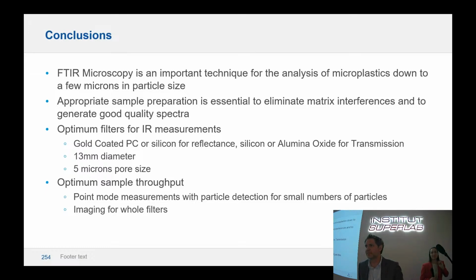Thank you for a nice presentation. I have one question regarding the reflectance mode. Is it really useful when you have particles that are irregularly shaped? They don't have a smooth surface, because we were trying something like this and it was not quite successful.